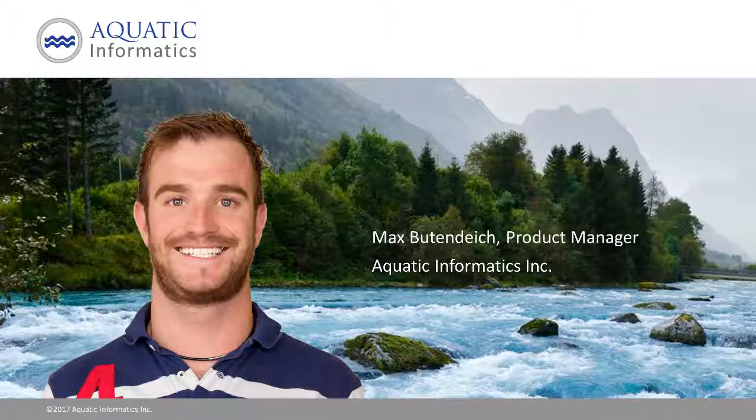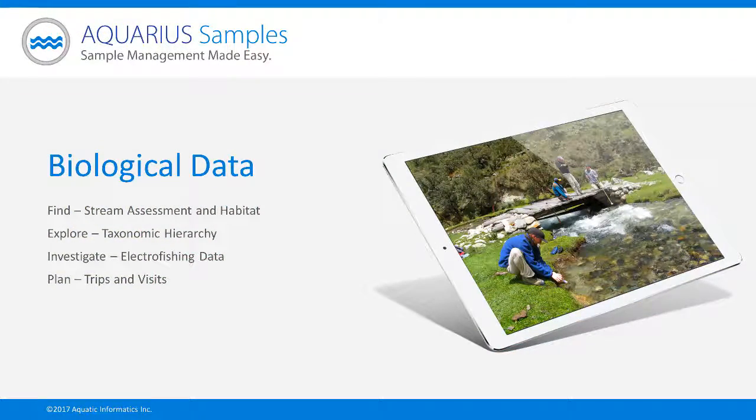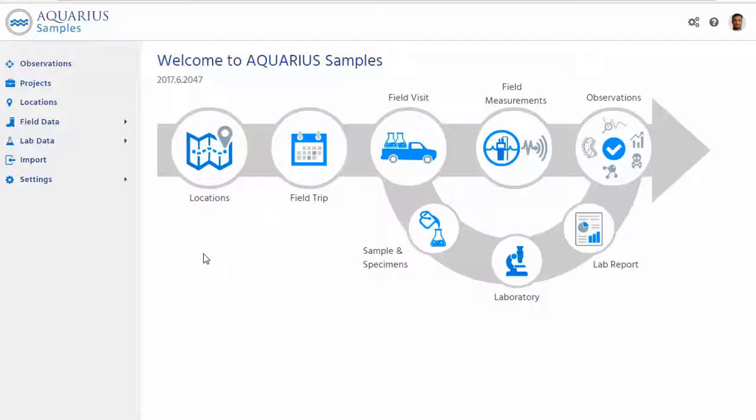Today again we'd like to show you some of the features of Aquarius Samples and how it can help you be productive and successful. Today we're going to look at how the system can reference data about biological information, habitat and biological data, and how it can be managed through a web software application like Aquarius Samples. Max, can you take us through an example of this type? Sure, let's get into it.